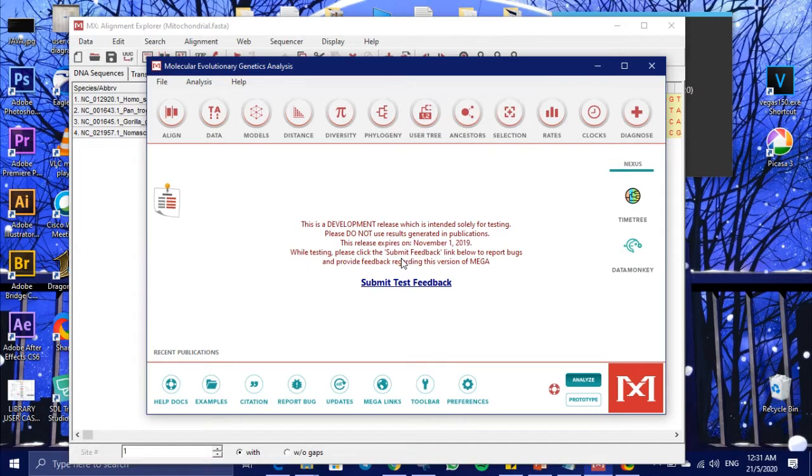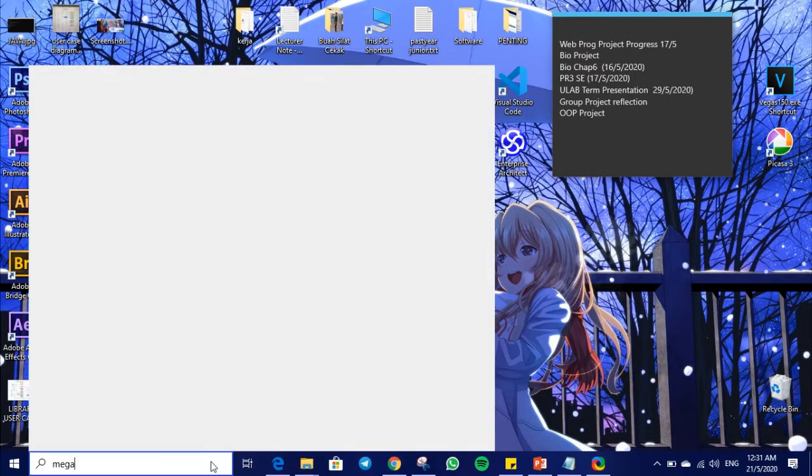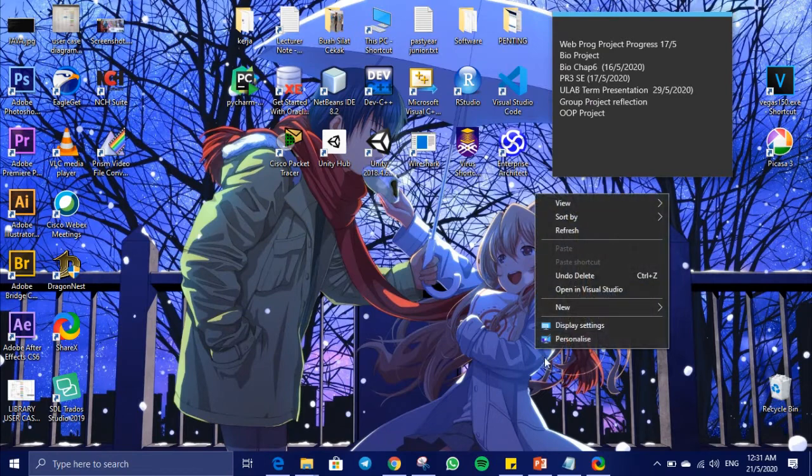So if you have the sequence, you download from the NCBI, and then you need to align the sequence, which is the FASTA format. So if you still not done yet, you need to search first, and you need to copy all the FASTA of nucleotide and merge in a text file. So after you merge in a text file, you need to save it. You need to convert the txt file into a FASTA file.